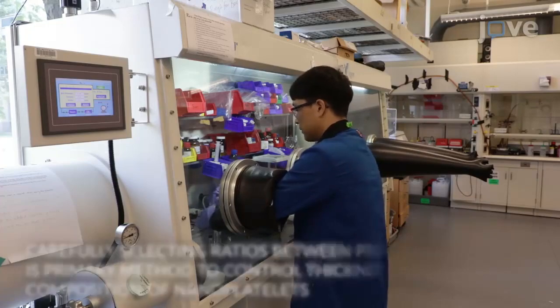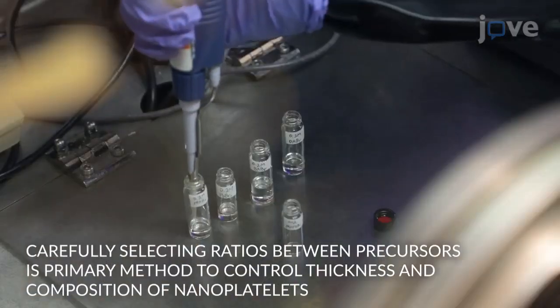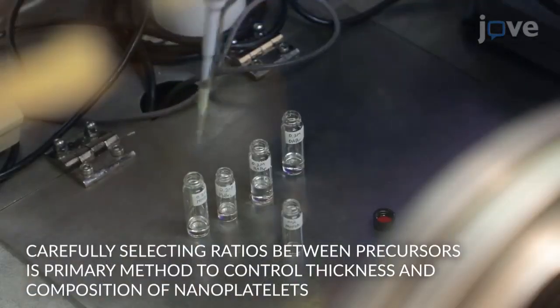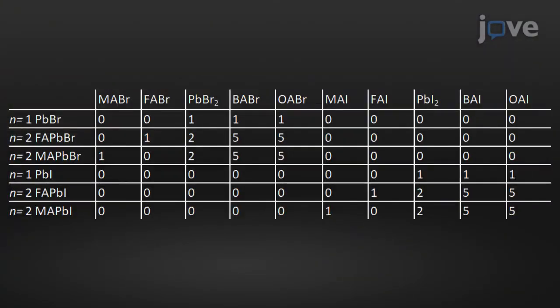To synthesize N=2 methyl ammonium lead bromide nanoplatelets, mix individual 1 milliliter volumes of the indicated 0.2 molar precursor solutions according to the table.